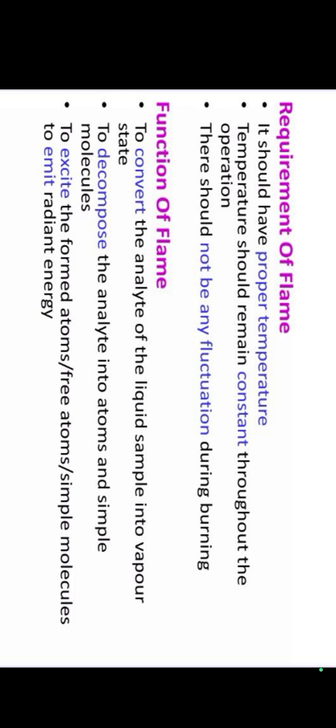First function is to convert the analyte into vapor state; the liquid sample is converted so the analyte is in vapor state. Second, decompose the analyte into atoms. Third, emit radiant energy. These are the functions of the flame.